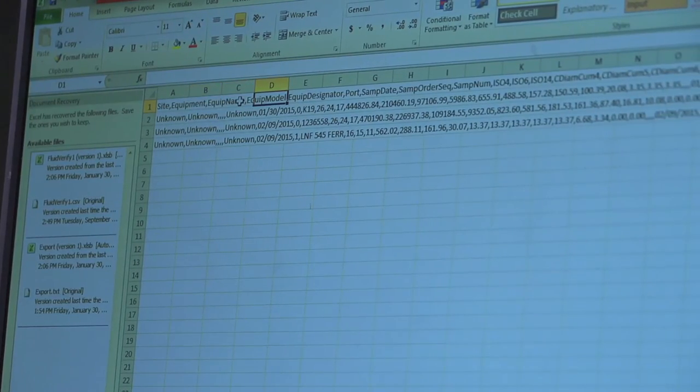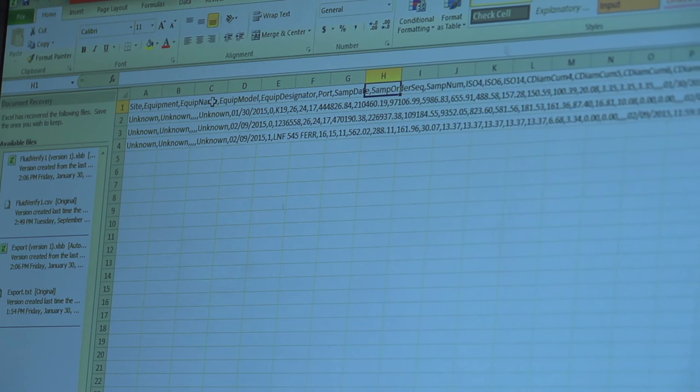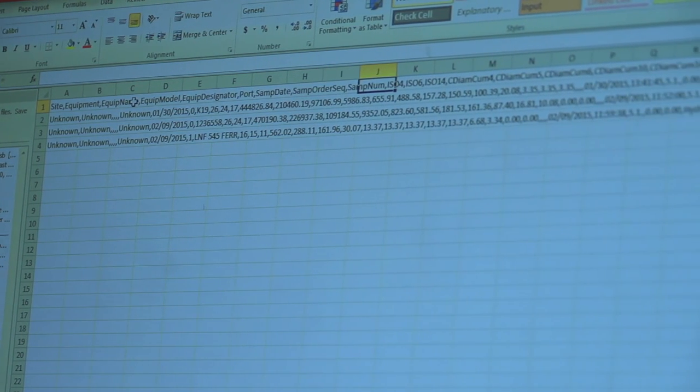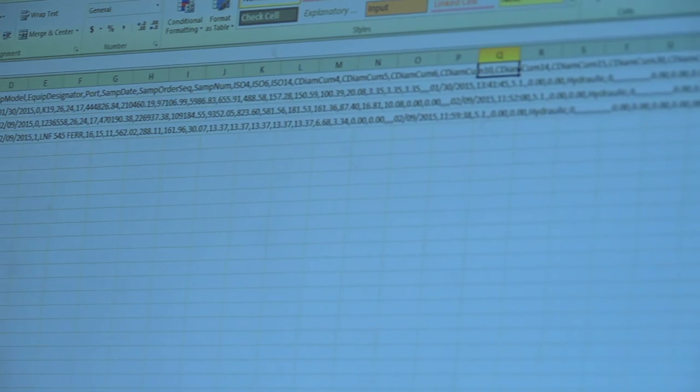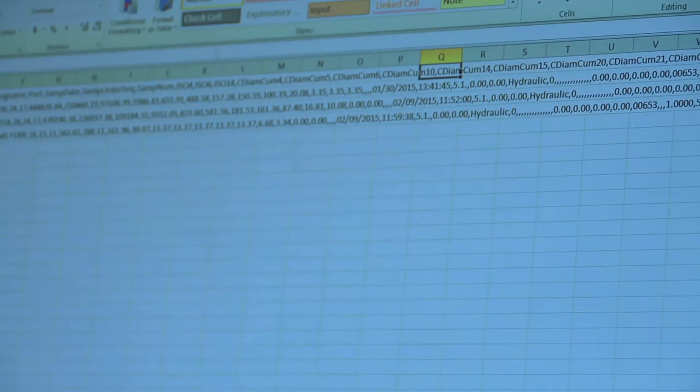So with a few clicks of the button, you can export either the data from a single sample or all of your samples, an entire database, and then open it up in Excel and be able to prepare your data for statistical analysis.